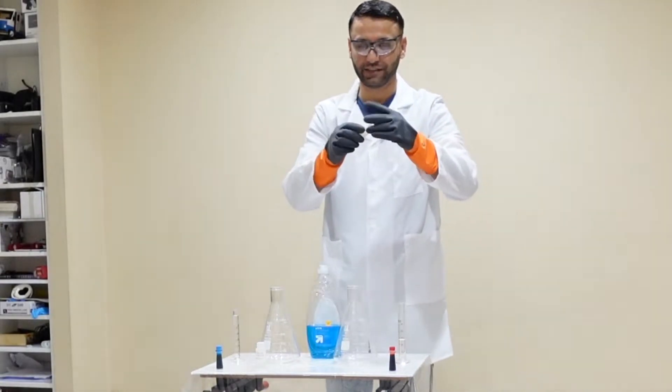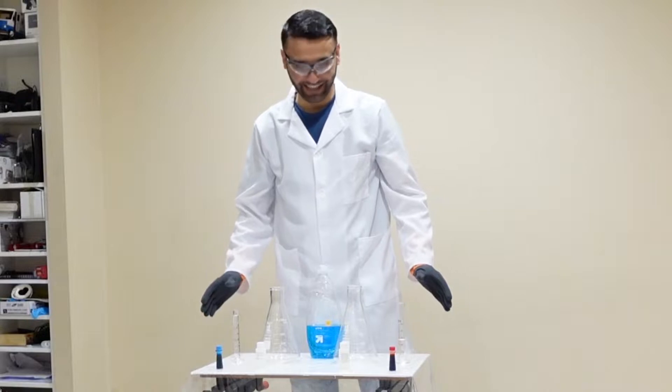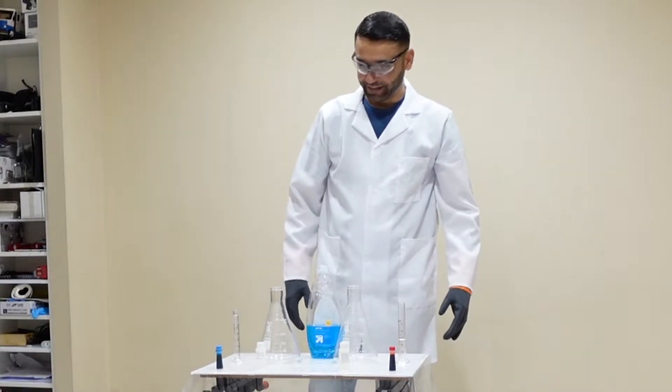This is 30% hydrogen peroxide. Hey guys, today I'm so excited for this — and I'm scared. Let's see what happens.